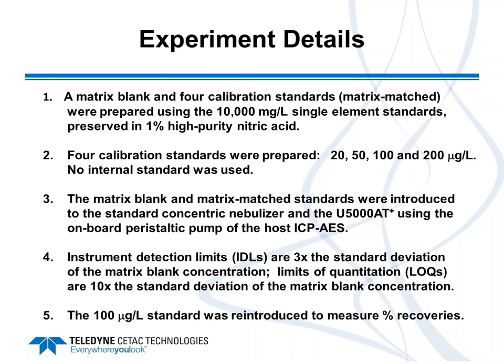We wanted to see just what type of data quality we would get under these conditions with a very hard water matrix. So these solutions were introduced both to the standard concentric nebulizer and to the ultrasonic nebulizer, the U5000 AT+, using the onboard peristaltic pump of the host ICP.